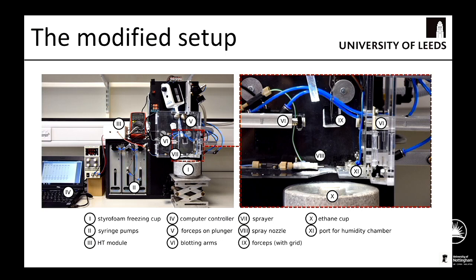And we plunge freeze it in a Vitrobot style container that's been slightly modified by snapping the middle. And then this here is the high voltage system that we introduced as well. So we actually apply a few thousand volts into the solution, and this helps to break up the spray. It's not quite a true electrospray, it's more voltage assisted spraying, but it actually gives us a finer dispersion of the spray, and it helps the droplets absorb onto the grid.